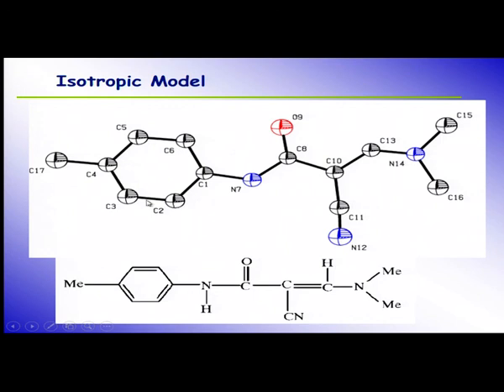So, let us close with this and we will continue later. We will again start with isotropic, we will go to anisotropic refinement and so on. Thank you.